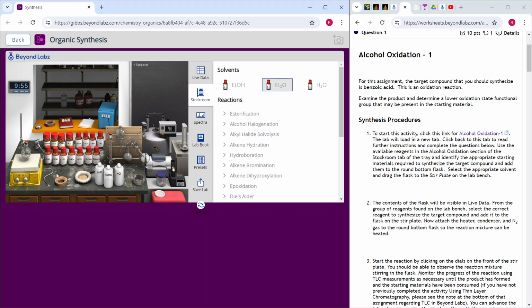So our reagent is going to be, let's see, what do we have there? We do have the chromic acid. Do you see that? This is the chromic acid in presence of sulfuric acid. This is a strong oxidizing agent, and this is what I need for this reaction. So I'm just going to bring it all the way here. And you can easily see that the color of the solution changes. I did not start the reaction yet. All I did is a color change.